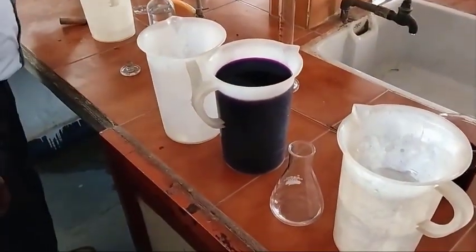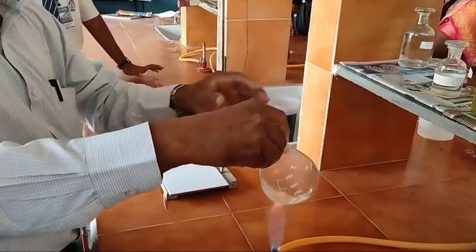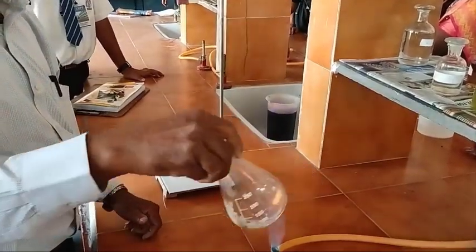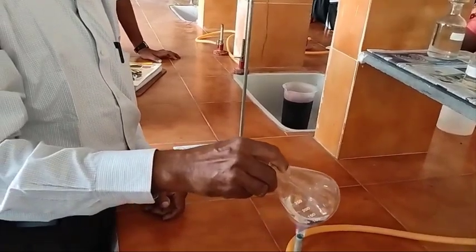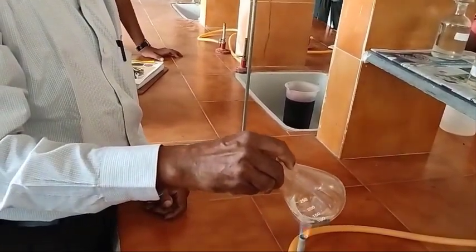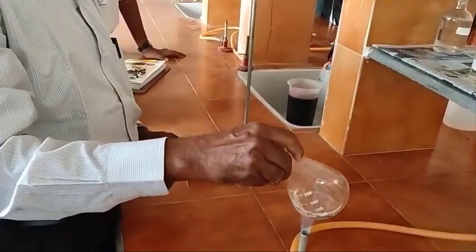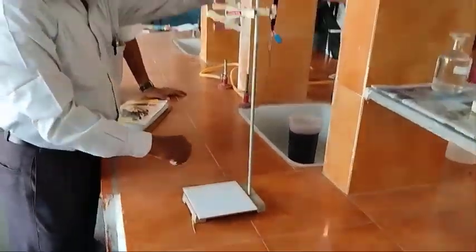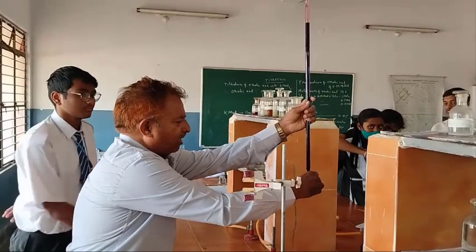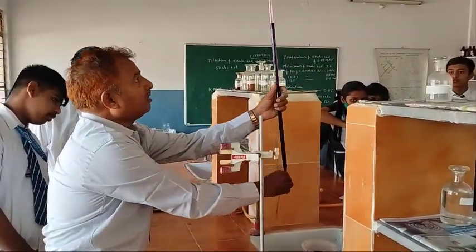Now heat this. See here, allowed. Therefore, see that there should be no air bubble.